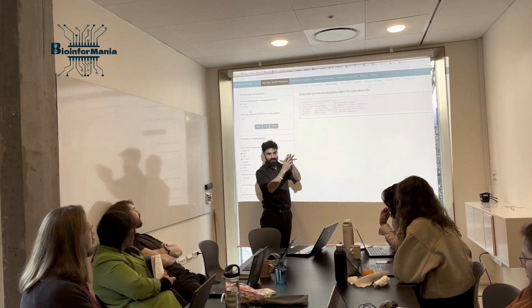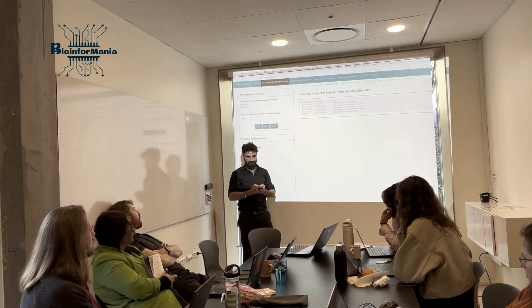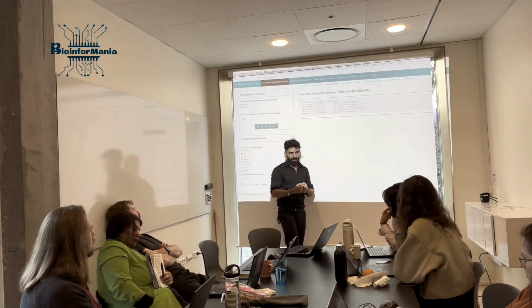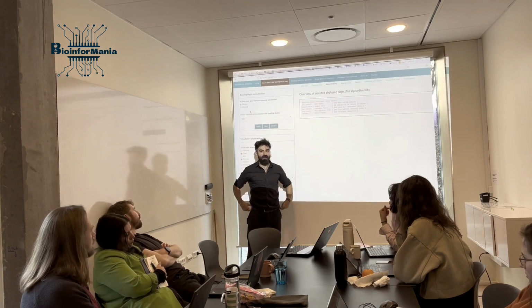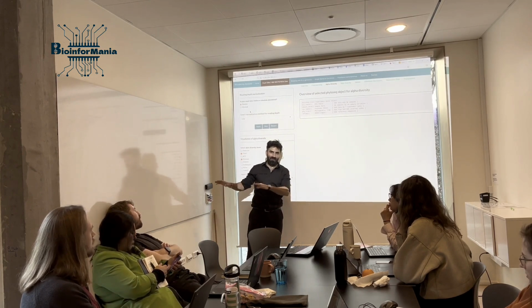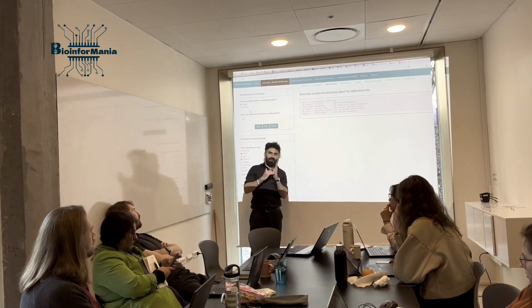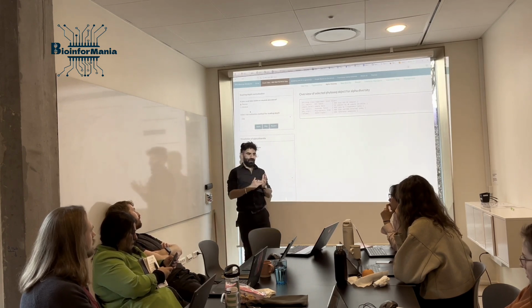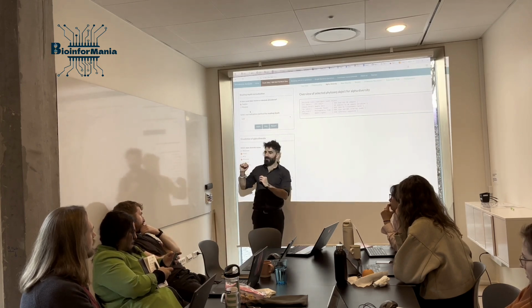So two samples go through two different pores, they are going to be a little bit different. So this within-sample variance, we need to account for somehow, okay? Let's say two samples have 10 copy number of 16S gene, and they should both have 10 copy number, but one shows 5 copy number, the other shows 6 copy numbers, or 7, or actually 10. What do we do in this case? We know these samples are identical and they need to be identical. We could do random sampling up to a certain level.